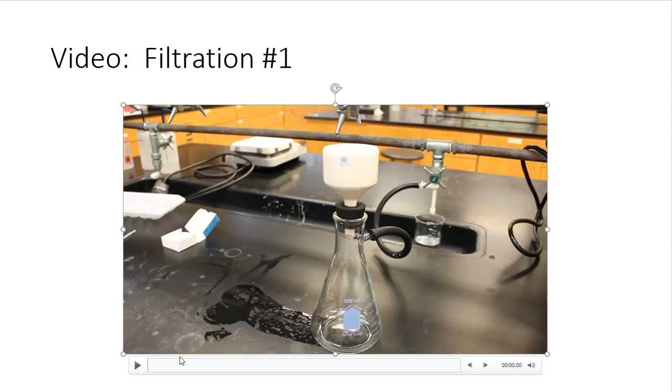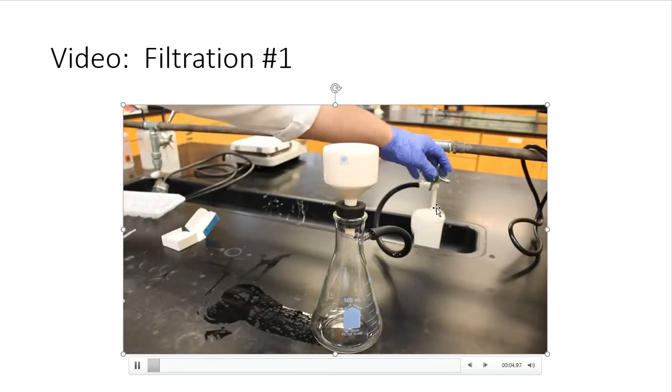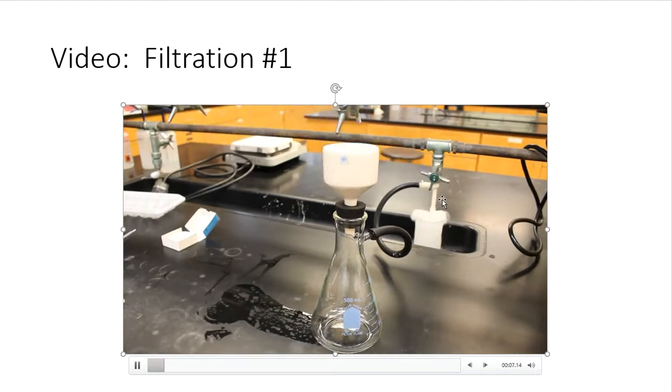So here's the vacuum aspirator. Back here in the back is my faucet. That faucet is connected to a hose that's on the filter flask that's right here. The Buchner funnel is going to sit on top. I'm going to put a piece of filter paper into the Buchner funnel. I'm going to turn the aspirator on, and we're going to filter our products together. All right.